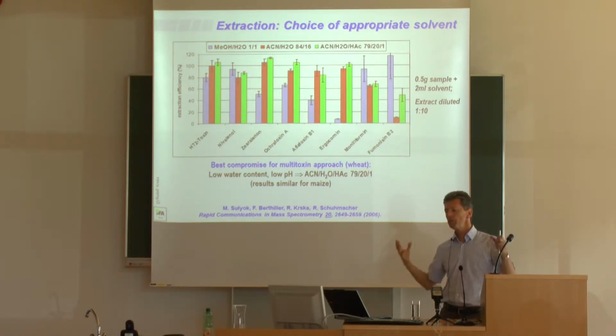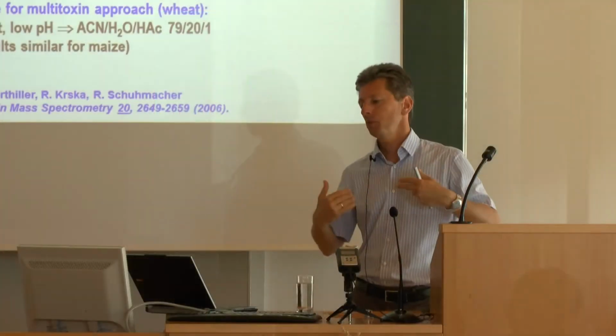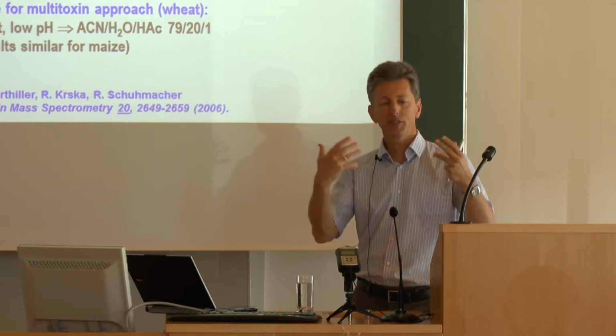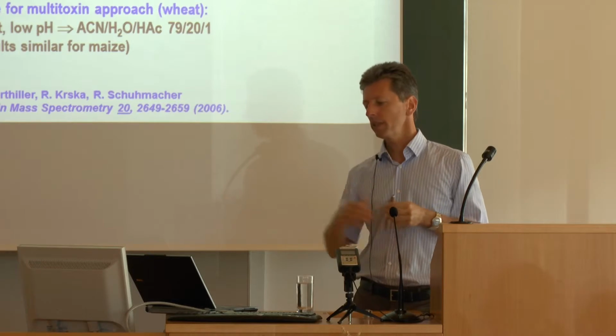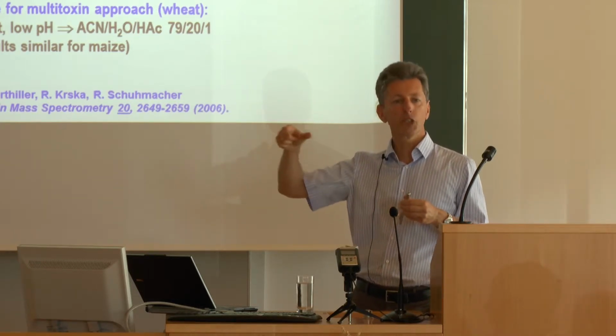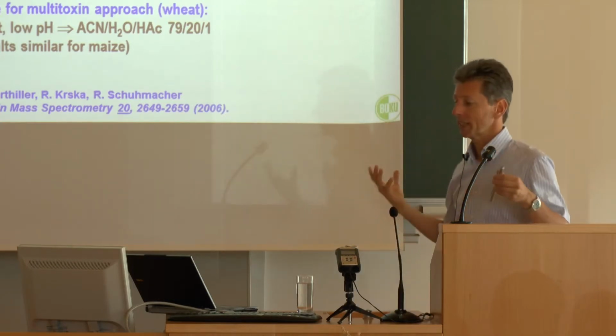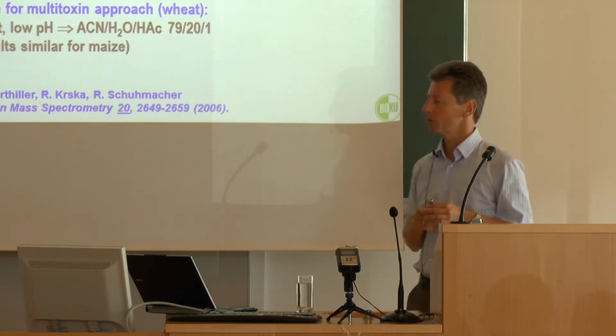What is the reason why we want a reasonably high recovery? A lower recovery potentially limits the sensitivity, the limit of detection of your method. But more importantly, lower recovery usually yields a lack of precision of your method as well. So one can summarize: at such a low recovery rate, the method is not under control.